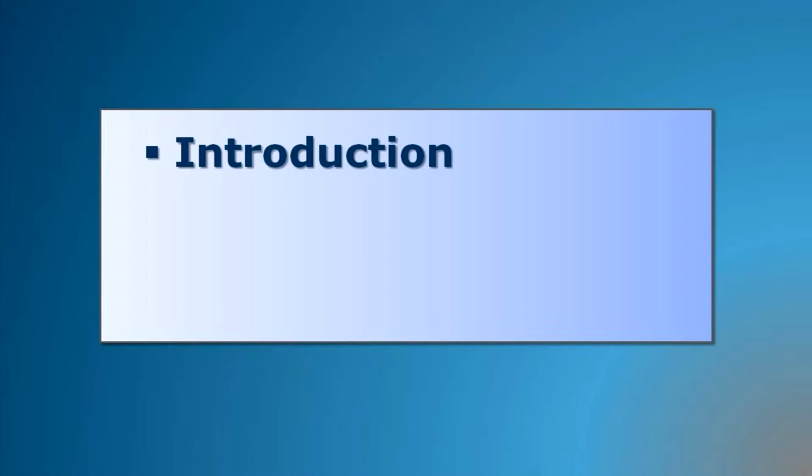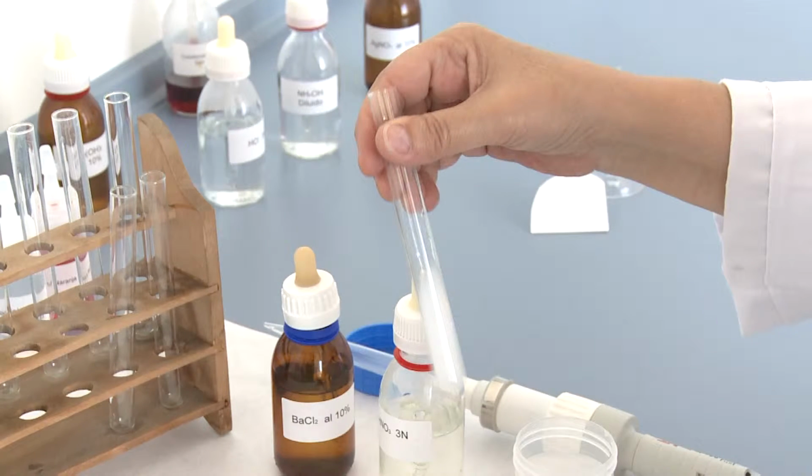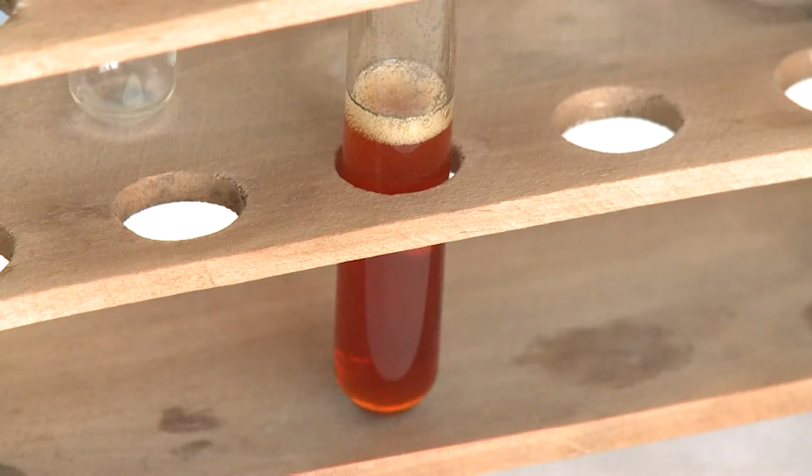Introduction. The qualitative assay of the determination of cations in water is based on the addition of some reagents capable of highlighting their presence, the different reactions, and then we will quickly make their preliminary analysis.